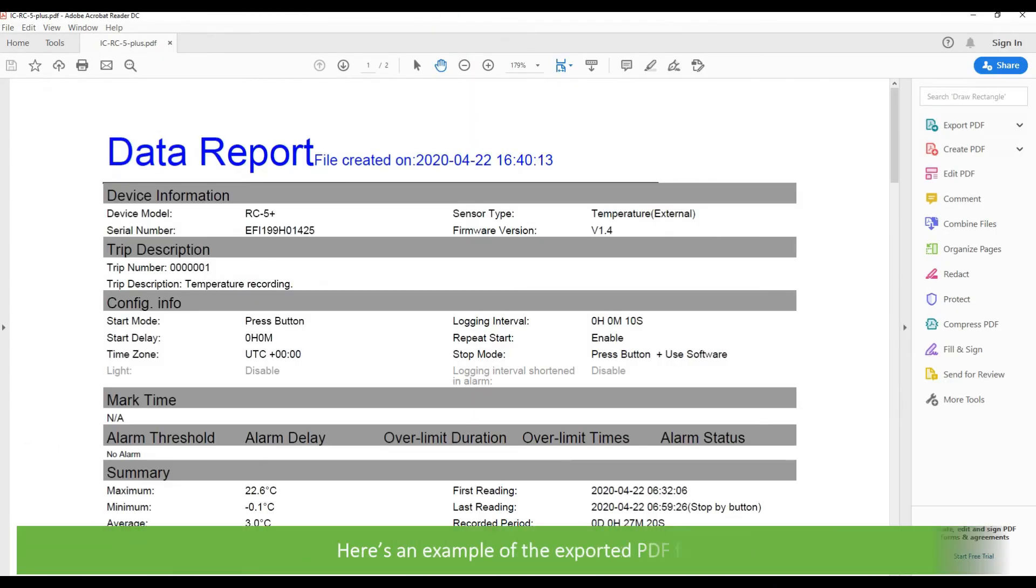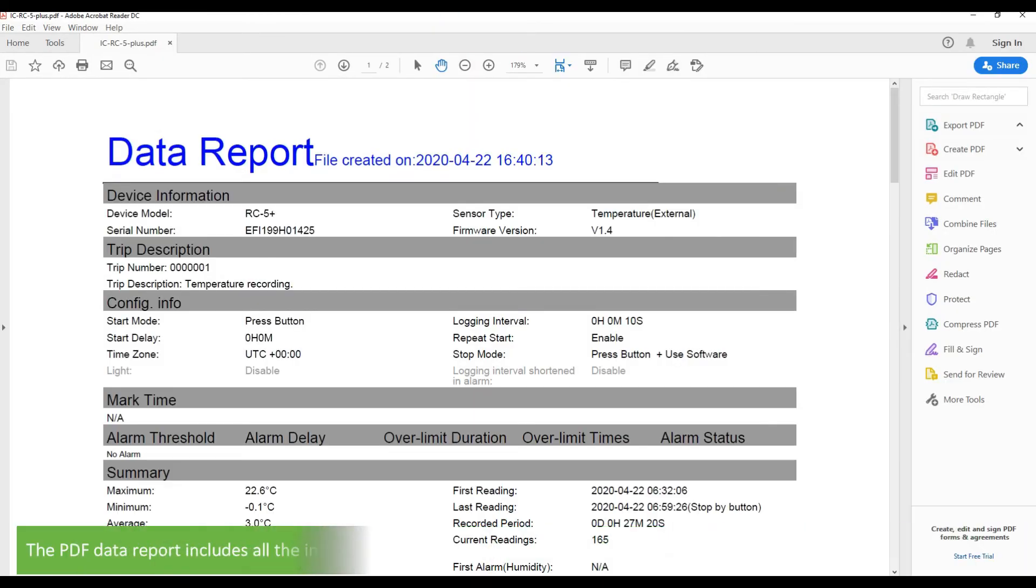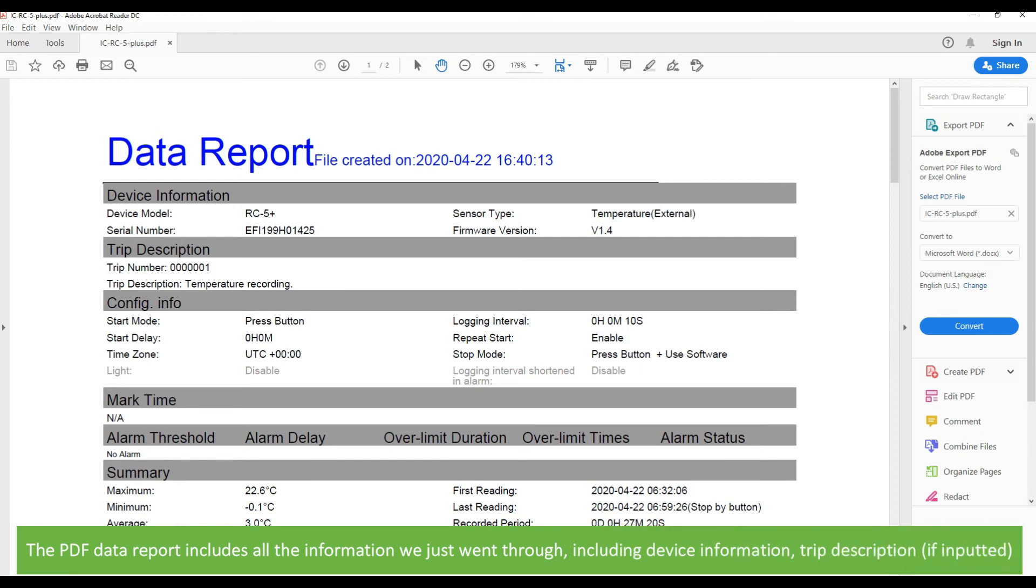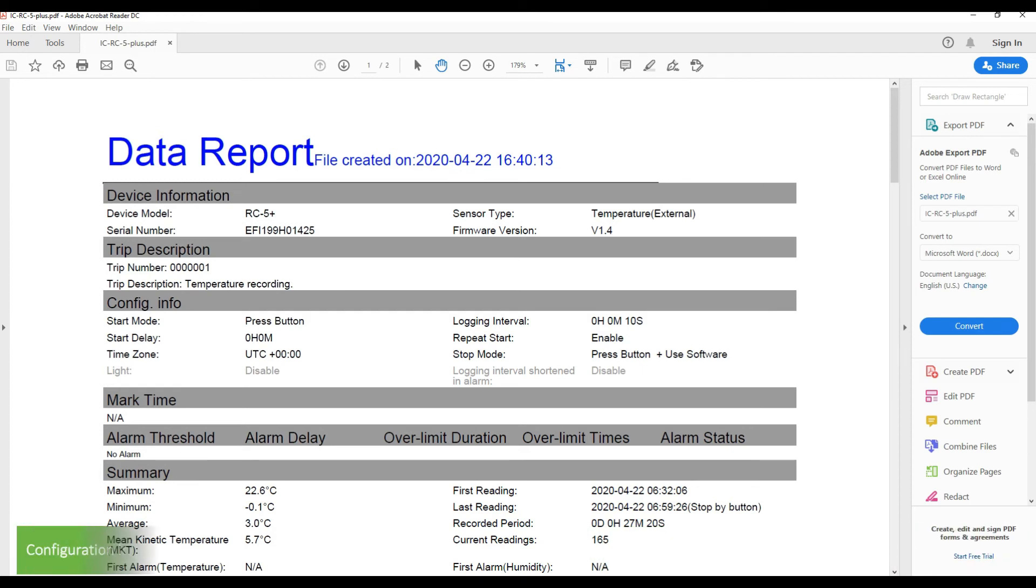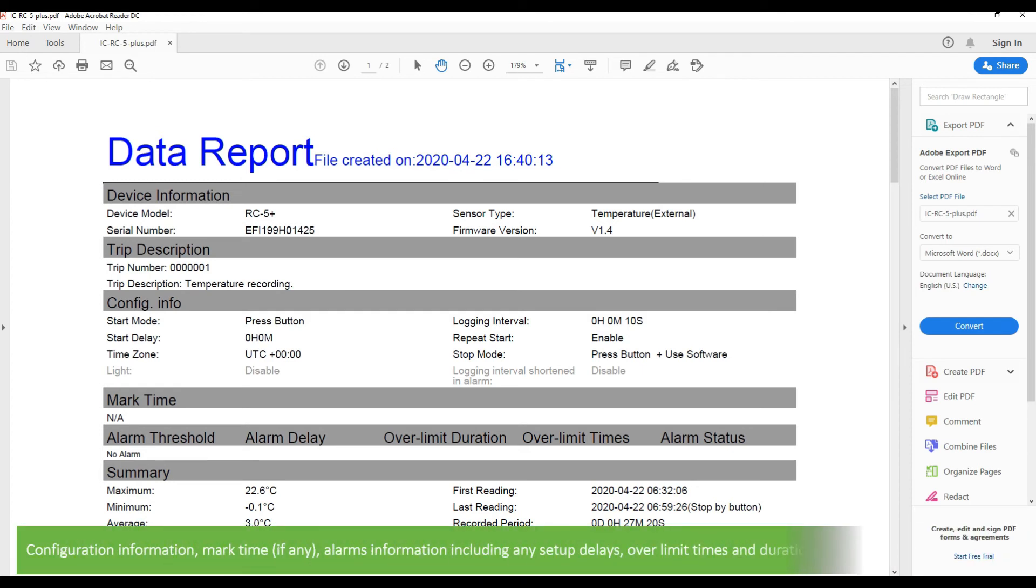Here's an example of an exported PDF file. The PDF data report includes all the information we just went through including device information, trip description, configuration information, mark time if any, and alarm information including any setup delays.